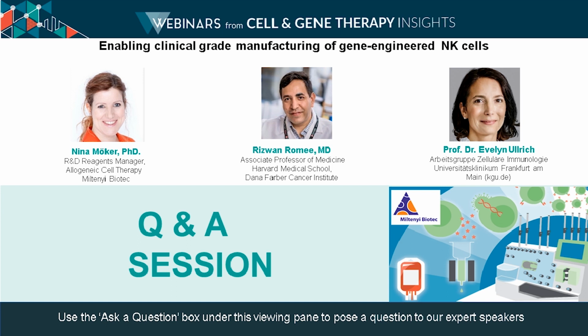Now, this goes for every new pseudotype: new challenges come with changing the pseudotype, because if you have a lentiviral vector production system that has been optimized for one pseudotype, things can change. The production protocol may have to be re-optimized. Maybe the titer determination is not working as efficiently as for the established pseudotypes. So there come new challenges with that, of course.